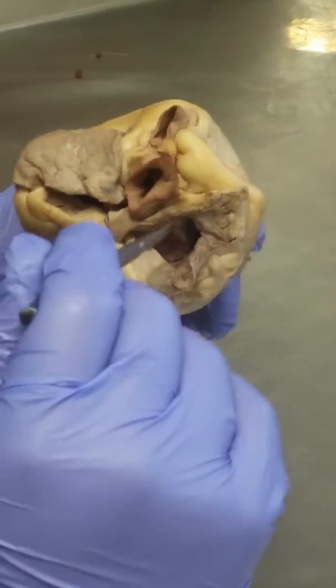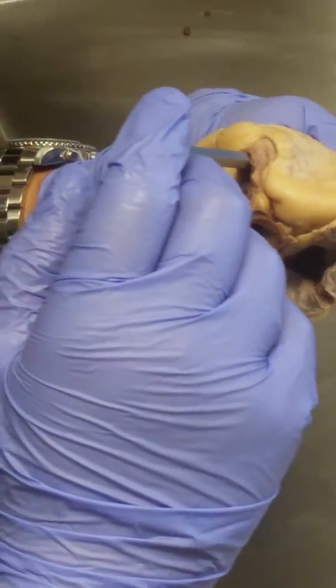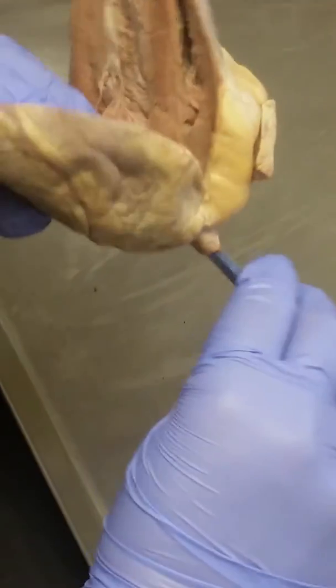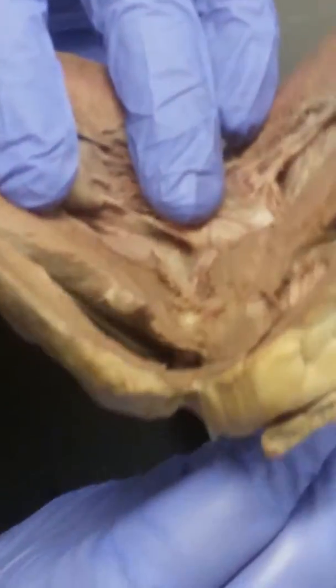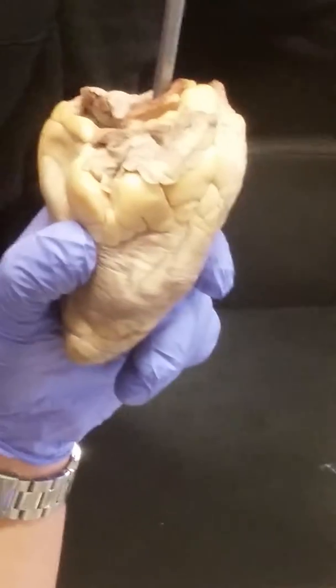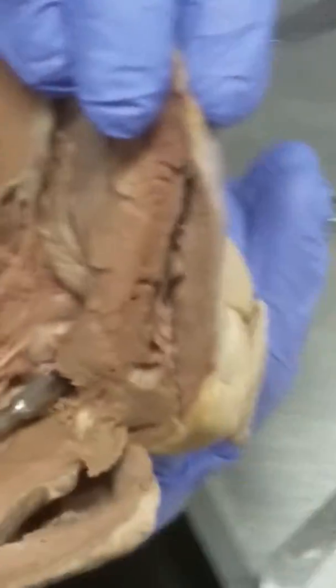So, if I stick my probe through here, the pulmonary trunk, what chamber should I be in? Atrium? The right ventricle. Well, would you look at that? I'm in the right ventricle. See that? If I stick my probe through this vessel, what chamber should I be in? The left ventricle? Are we all on the same page? All right. Oh, would you look at that? I am in the left ventricle.